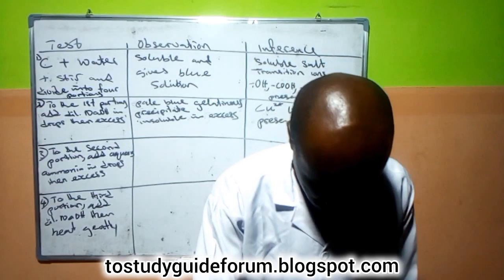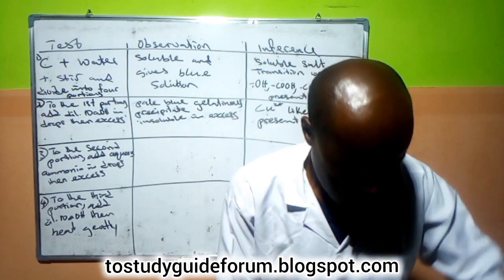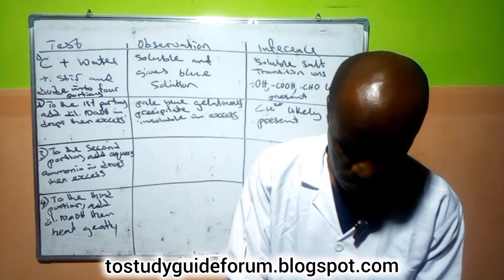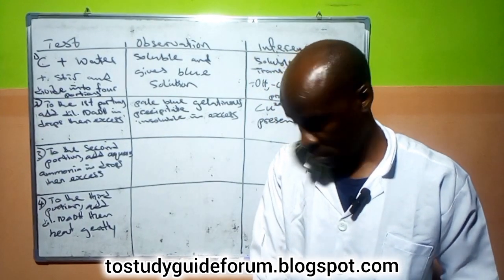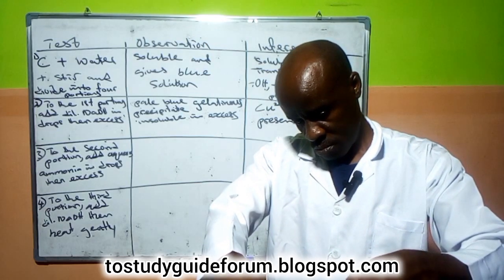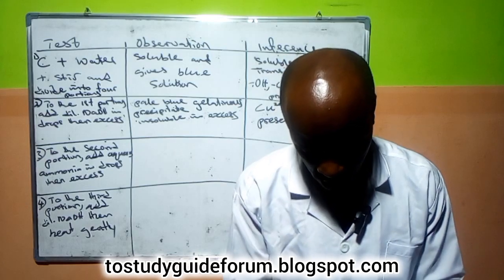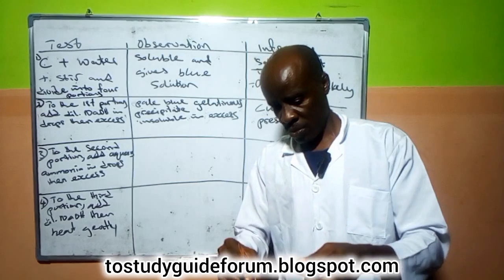Where is the aqueous ammonia? Now, aqueous ammonia in drops.